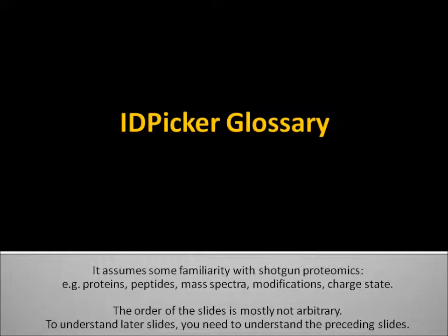In this tutorial/glossary, I will introduce vocabulary used in the IDPicker 3 application and in other tutorials. I will assume you're already familiar with proteins, peptides, modifications, mass spectra, and charge states.